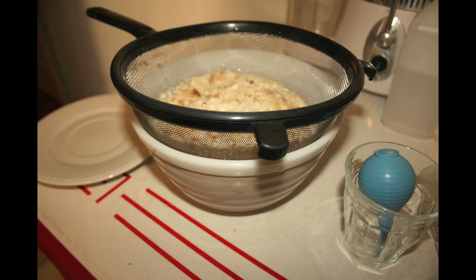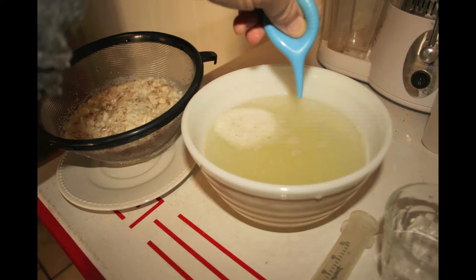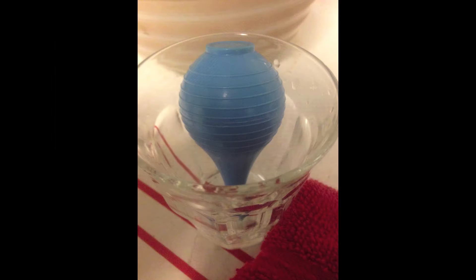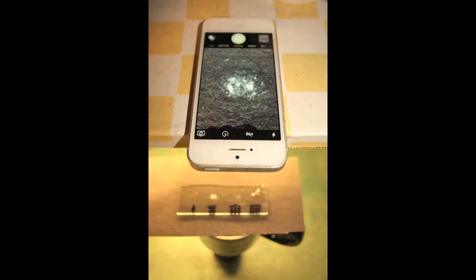It foams up a little bit and can make a mess. Basically, you're going to wait about 10, 20, 30 minutes, an hour, or two hours. Then you go in with a plunger of some kind and suck the liquid from the bottom of the bowl — that's where the worms wind up, at the bottom. You prop up your suction device so the opening is at the bottom, and it helps the worms sink more. Put it on a glass slide a drop at a time. You can do this over and over again. Without a microscope, you're back to the same smartphone setup. Zooming in on the water droplets — the lighting really helps.